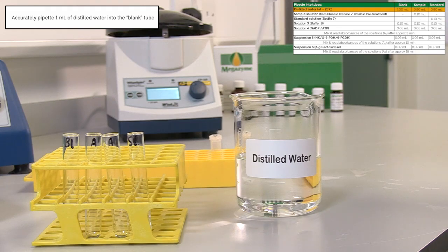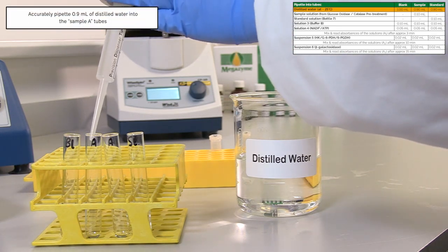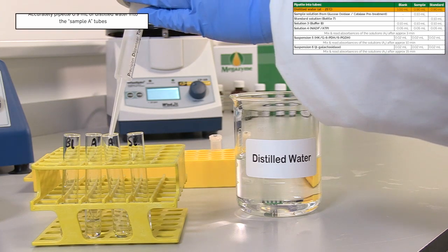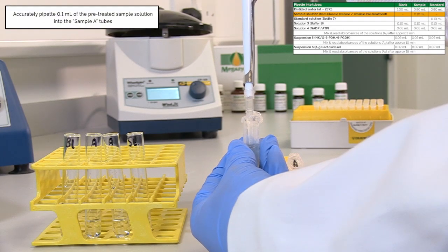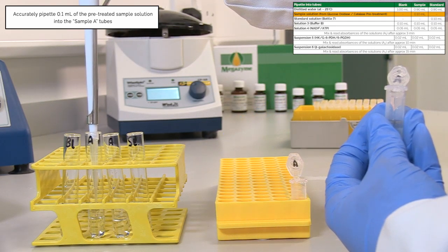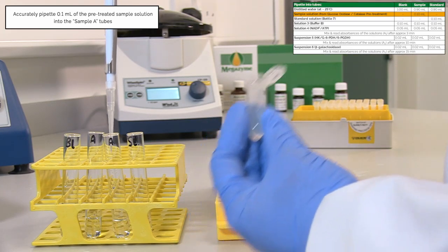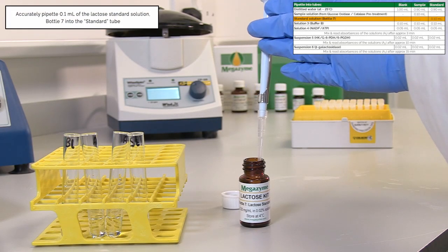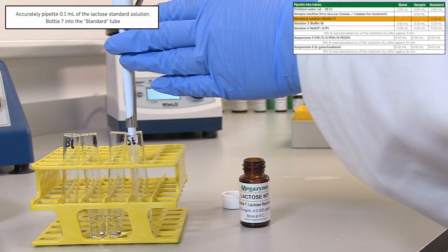Accurately pipette 1 ml of distilled water into the blank tube, 0.9 ml into the sample A tubes, and 0.9 ml into the standard tube. Accurately pipette 0.1 ml of the pre-treated sample solution into the sample A tubes. Accurately pipette 0.1 ml of the lactose standard solution, bottle 7, into the standard tube.